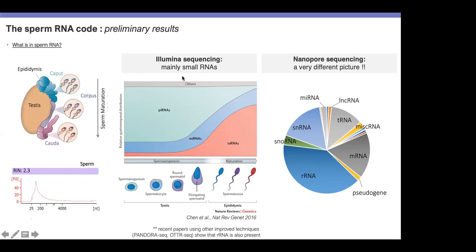And now we're trying to do more of an aggregate analysis to see, if we compare, for example, different conditions, whether these ones are degraded or not degraded in the next stage during maturation more than the others, and so on, right? But to do this transcriptome wide takes a while, right? But yes, there are cases of m6A specific isoform modifications.